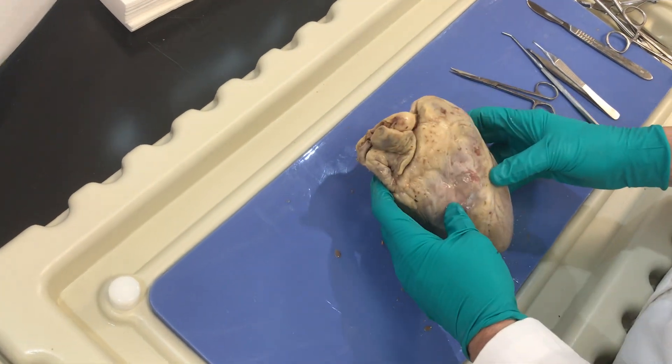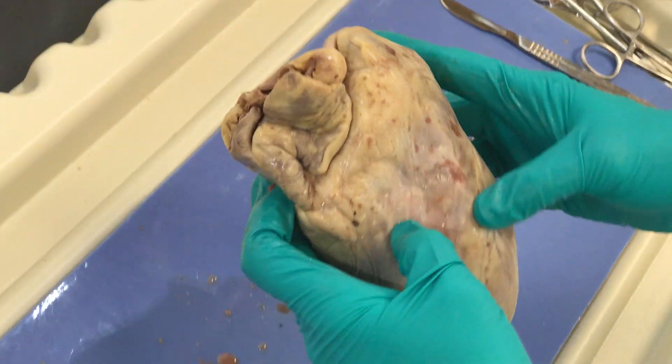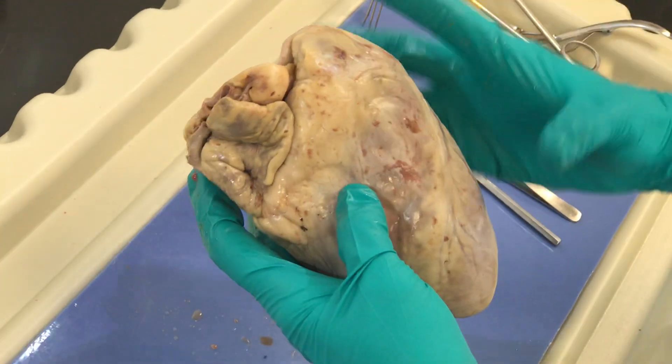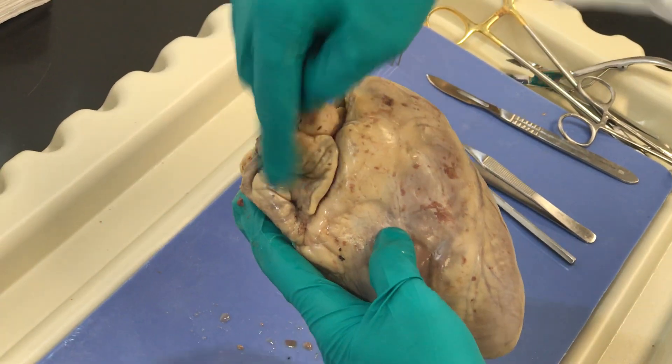All right students, we're going to dissect the heart today. Remember to orient yourself externally — we talked about that previously. Now I'm going to have my heart oriented to me. We have the right ventricle here, left ventricle here, left auricle, right auricle.